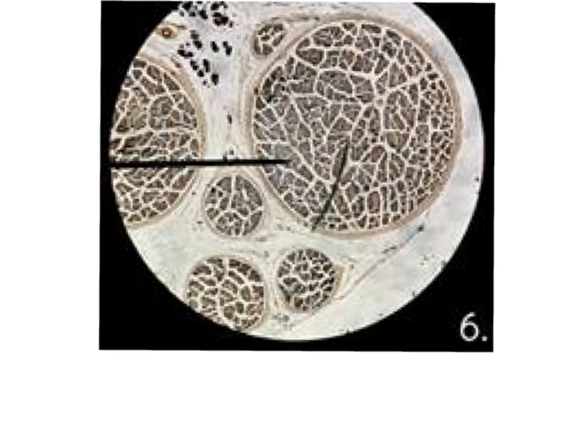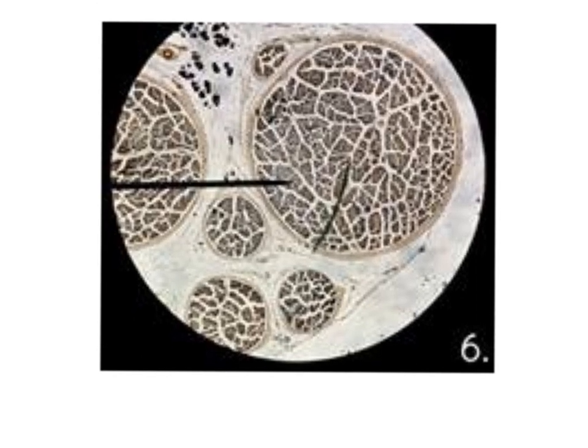This is the same picture. It is the slide of the nerve trunk stained with osmic acid. As we see, it is characterized by the color, it is characterized by the nature, bundles, and each bundle contains these nerve fibers, very small, not evident in the picture, small nerve fibers inside this bundle.